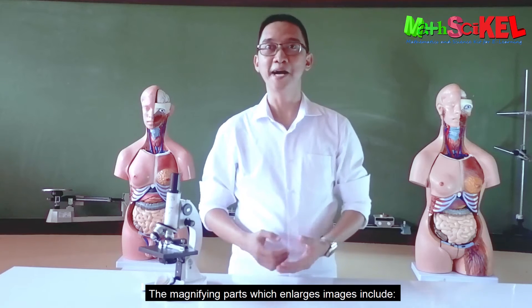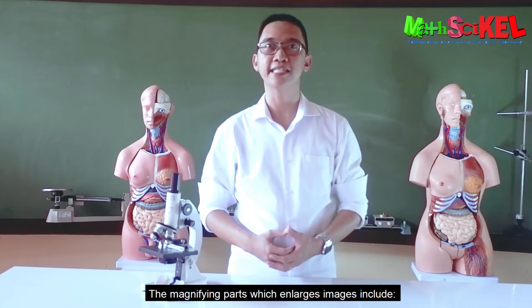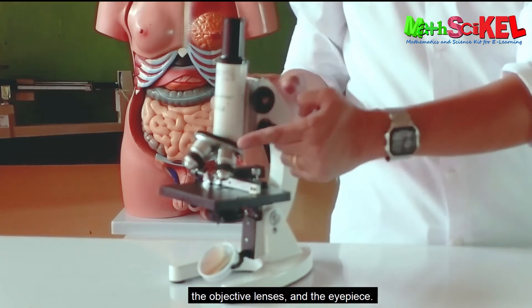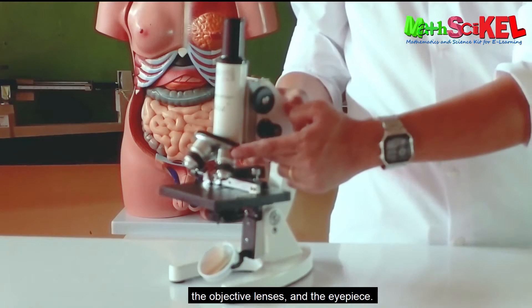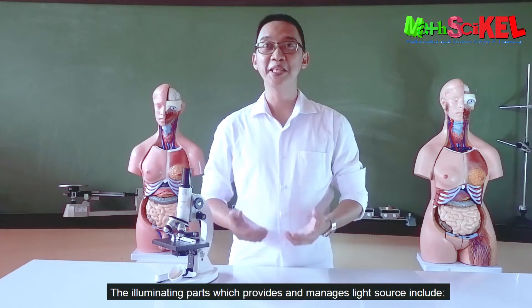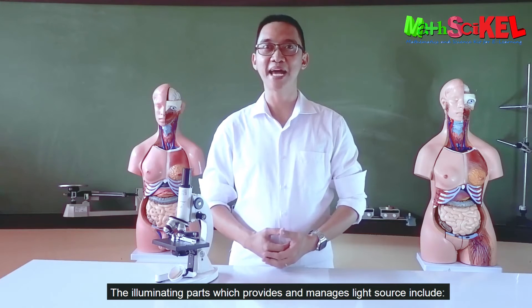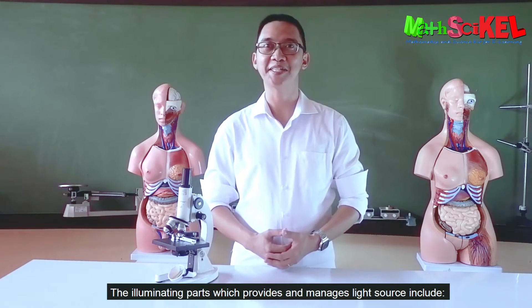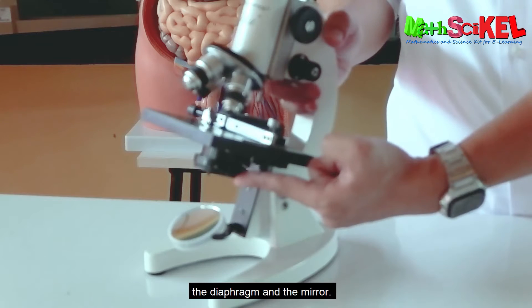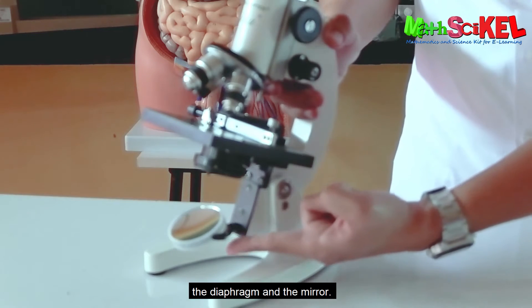The magnifying parts, which enlarge images, include the objective lenses and the eyepiece. The illuminating parts, which provide the light source, include the diaphragm and the mirror.